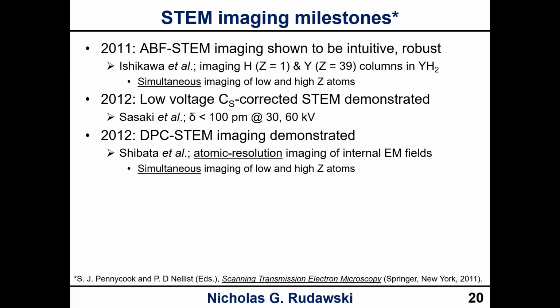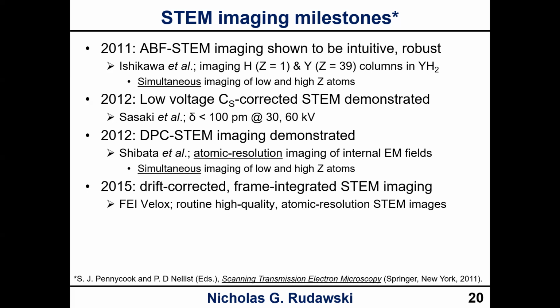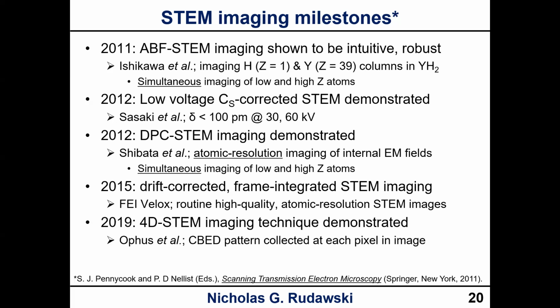In 2012, DPC, or differential phase contrast STEM, was demonstrated at atomic resolutions as a way to image internal electromagnetic fields in samples. And in 2015, FEI introduced drift-corrected frame integration as a commercial software package using their Velox software, which works great for routine high-quality atomic res STEM imaging. And then in 2019, the 4D STEM imaging technique was demonstrated. The idea being that you're collecting and recording a CBED pattern at each pixel in an image.